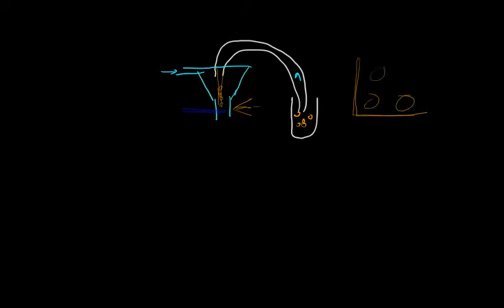We see these three populations. That means anytime a cell of interest is crossing the laser here, the cell shows up here as a dot. The other type of cell, when it is crossing the laser, shows up here, and so on and so forth. So we set the population. What happens as the cells are crossing the laser here, the cells travel through and they go to the waste. If you are not sorting, then there is a waste cup, so it takes the sample into the waste.